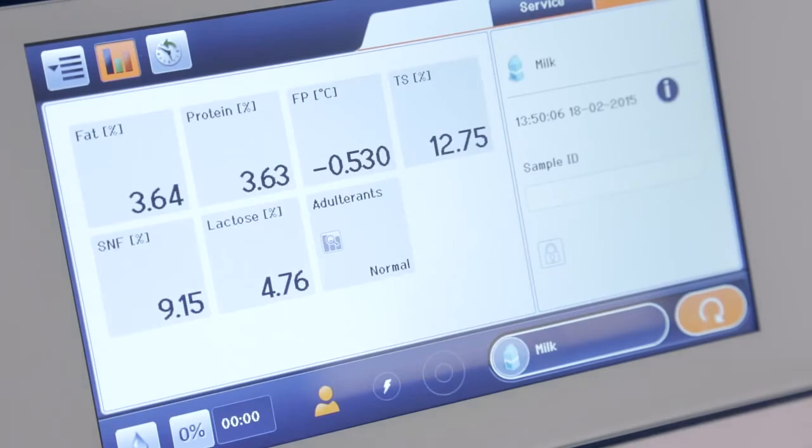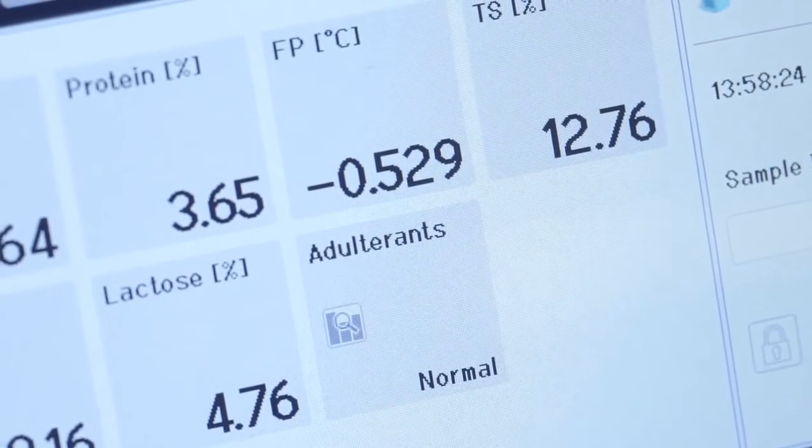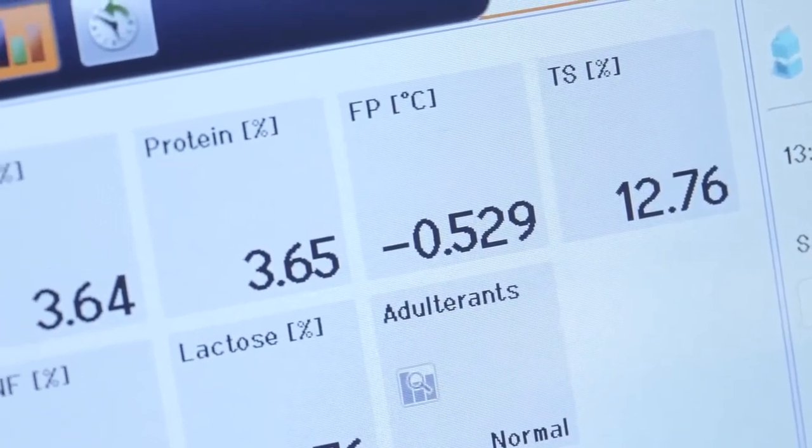Adulteration screening options allow you to check milk for abnormalities such as known or unknown adulterants and added water.